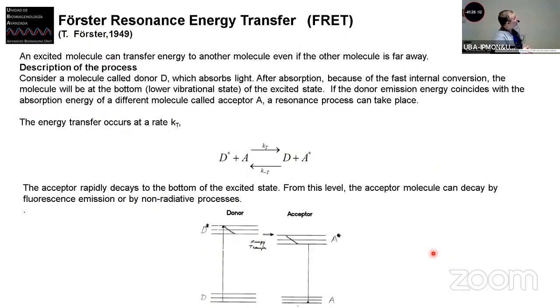So I will not spend my time talking about fluorescent resonance energy transfer, but basically what we want to know is if 2 molecules are interacting. And nowadays we can include in DNA, in plasmid, a protein of interest with a fluorescent protein or other kind of labels. And if we want to know if a molecule can interact with some other, you can see by these processes of Forster energy transfer the proximity of these two.